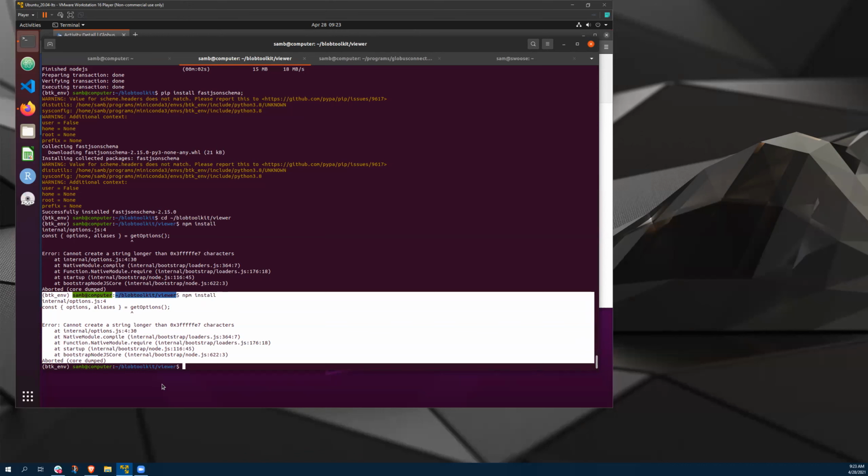Okay. npm install node.js. Successfully installed this. npm install. That's very interesting. Okay, good, we found the problem. I'll poke around and see if I can figure out what this all means. Sorry about that. No problem.